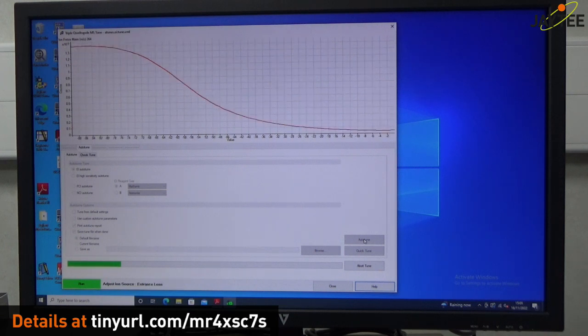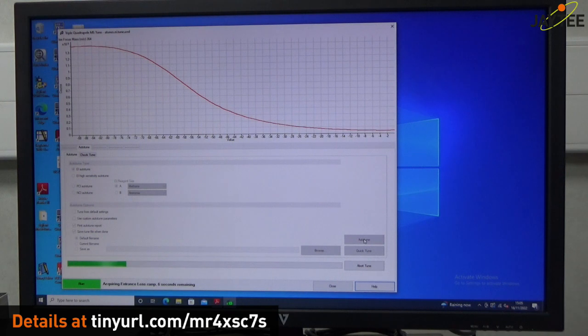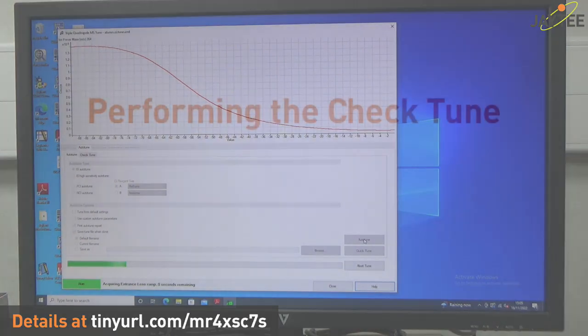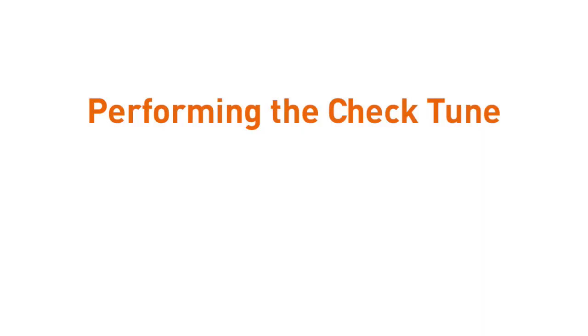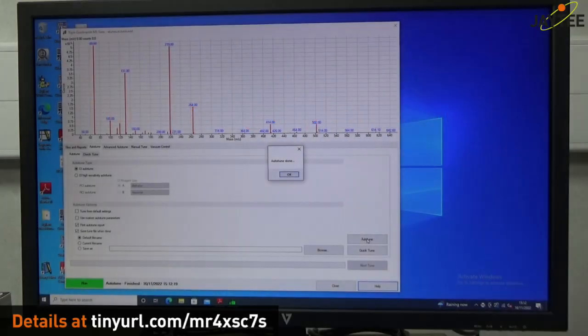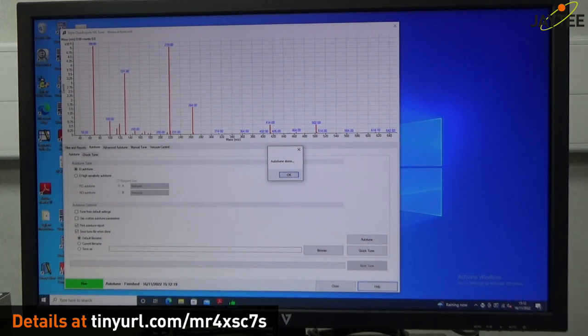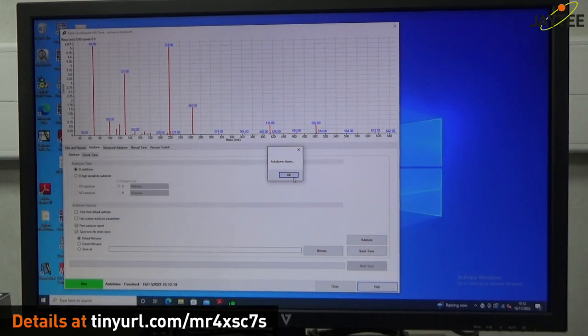And at the end you'll get a good print out, which I'll attach to the link that's going to be provided. So the auto tune is now done. Press okay.